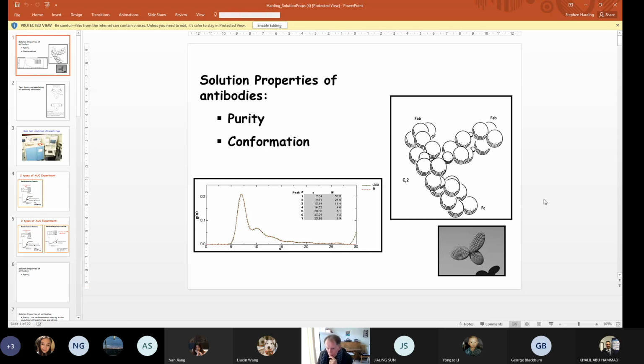But this model here, called a bead model, is of a particular class of antibody which doesn't have much of a hinge region. In fact, it has an extra constant domain. This is the model for IgE. So IgE is a class of antibody molecule which doesn't have significant flexibility because of the extra constant domain region rather than the hinge region.